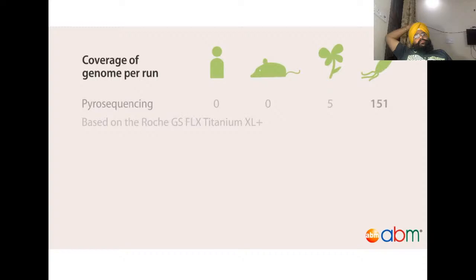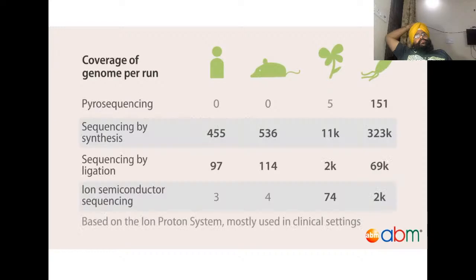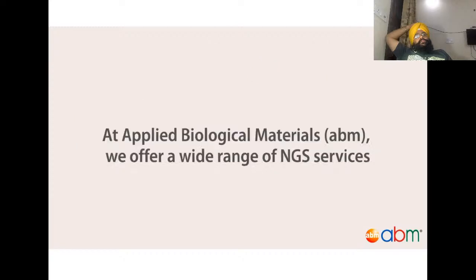The sequencing by ligation method also generates enough coverage for all genomes to be used. However, it isn't capable of generating nearly as much output as the Illumina HiSeq machines. The Ion Proton machine is used mostly in clinical settings because it is able to provide a sufficient size output within 2 hours. ABM offers a wide range of next-generation sequencing services.